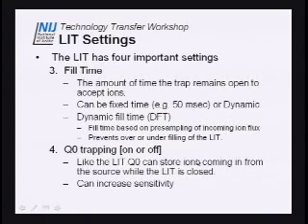One of the things we talked about when we were discussing a linear ion trap, or ion traps in general, is that they have a fill, close, and scan cycle. While they're closed and scanning, what's happening? I'm losing stuff. It's being pumped to vacuum. Well, this instrument allows you to store those ions that would normally be pumped to vacuum in Q0 for a few milliseconds, and then it releases that pulse. That pulse is part of the reason why the order of collision energies matters, because they're being held there for a few milliseconds and then released into the instrument. Okay?